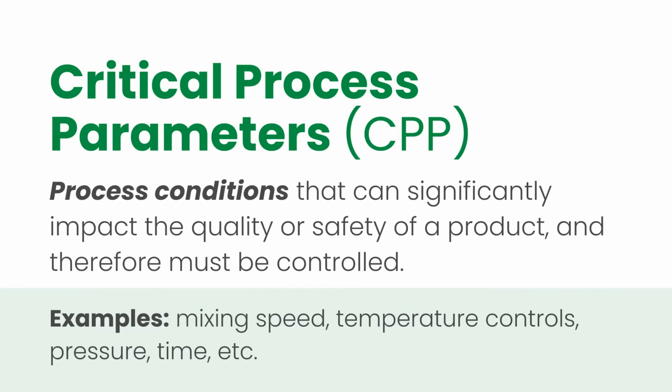There are several ways to aseptically fill drug product, each with their advantages and drawbacks. Biosafety cabinets are a great solution to mitigating cross-contamination from a room to the interior space of the hood. But a biosafety cabinet does have an opening on the front. The likelihood of bringing in particles and/or contaminants is higher than in a closed system.